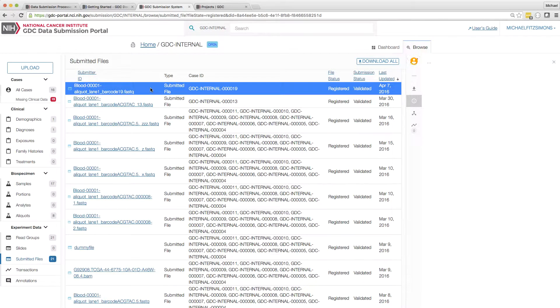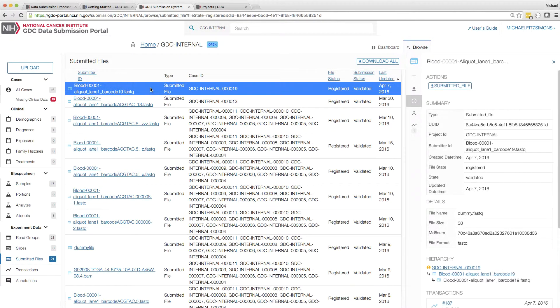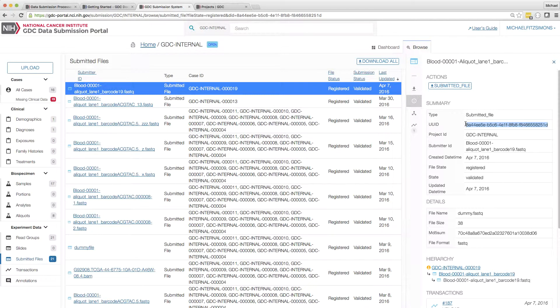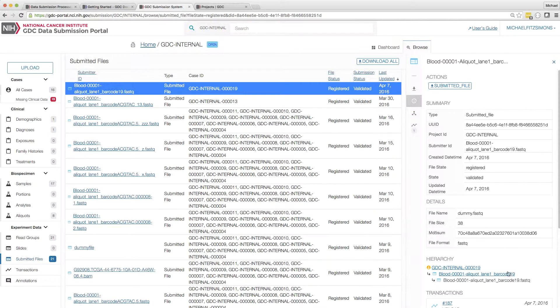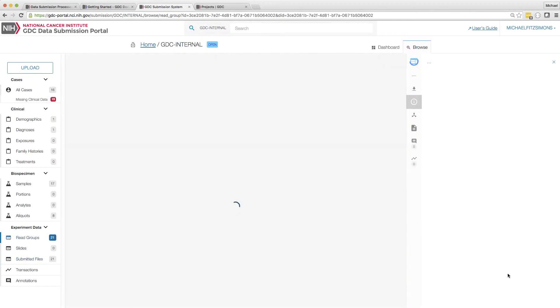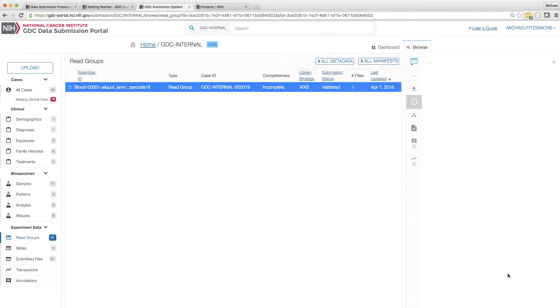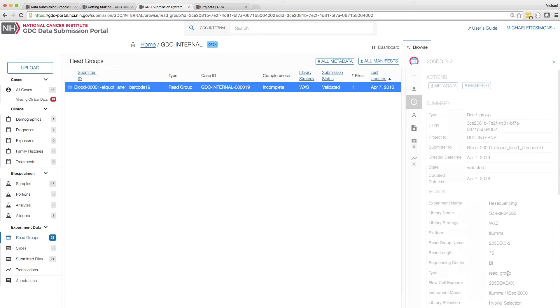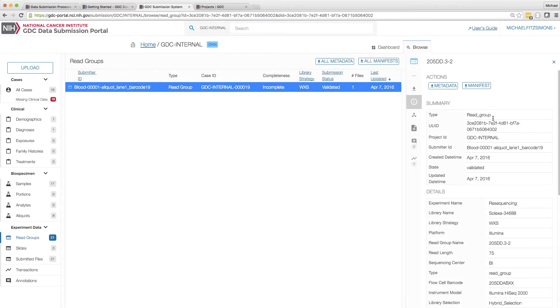I can now use the DTT in a couple of different ways. Either I can specify the UUID, which is a unique ID for each entity within the GDC. Alternatively, I could create a manifest, which specifies multiple files simultaneously and passes that information to the DTT.